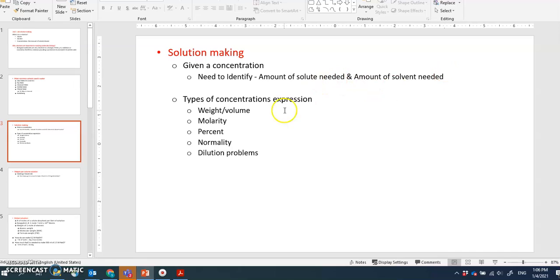So, ratio. There are different ways of doing that. Here are the ways. You can basically write down the weight of the solute that you need in the amount of the solvent you're going to mix together. So weight of the solute per given volume, a weight per volume ratio. When you do that, this volume should be the total combined volume of the solute and solvent, not just the solvent volume only. Okay, so the combined volume is the volume.